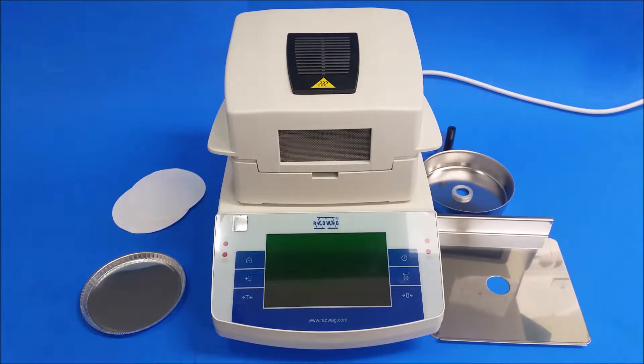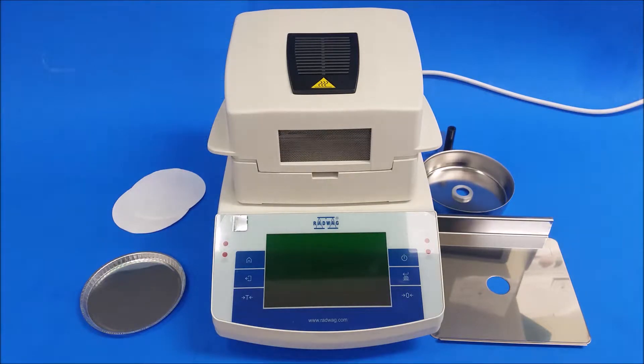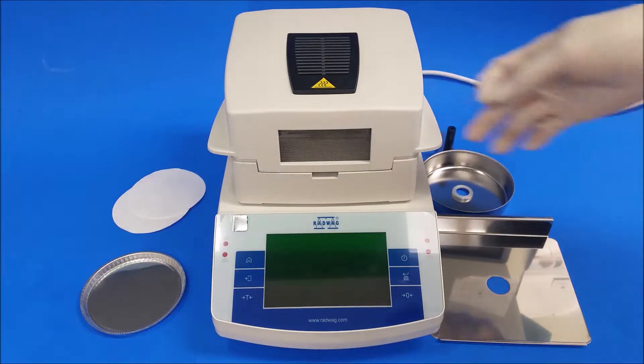Hello everybody, DSC guy here. Today I'm going to show you how to run a test on your Radwag MA50-1.X2. First thing we're going to do is put in the original parts, so we're going to lift up the hood.